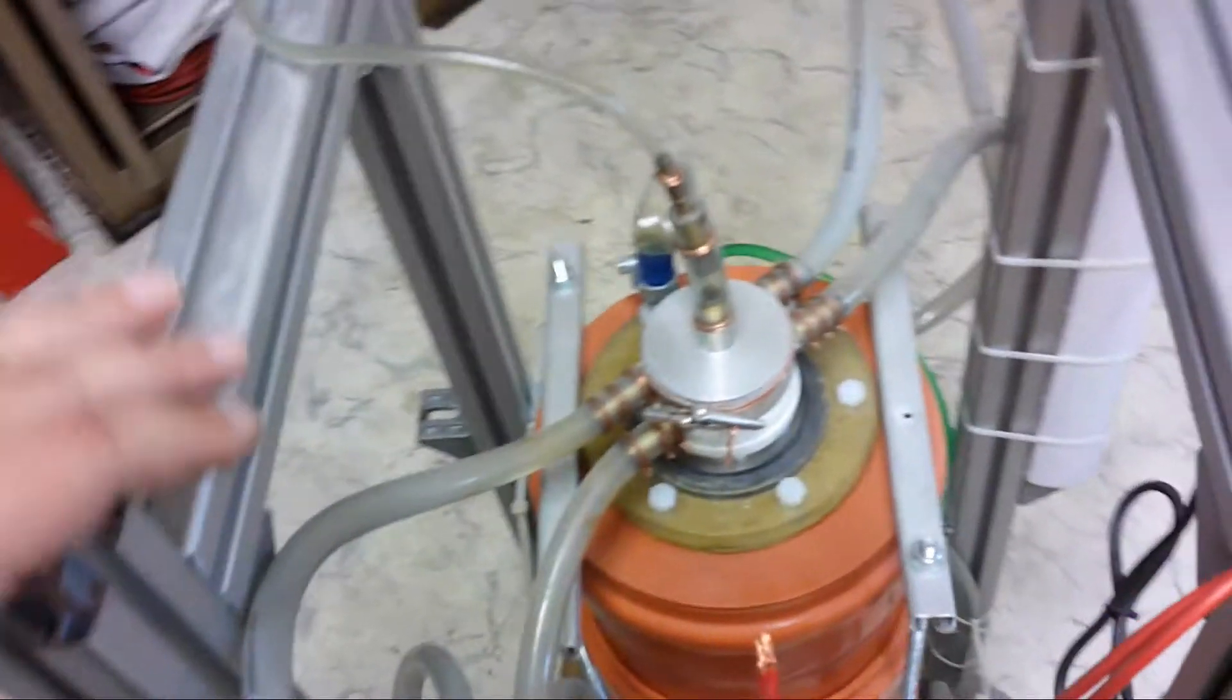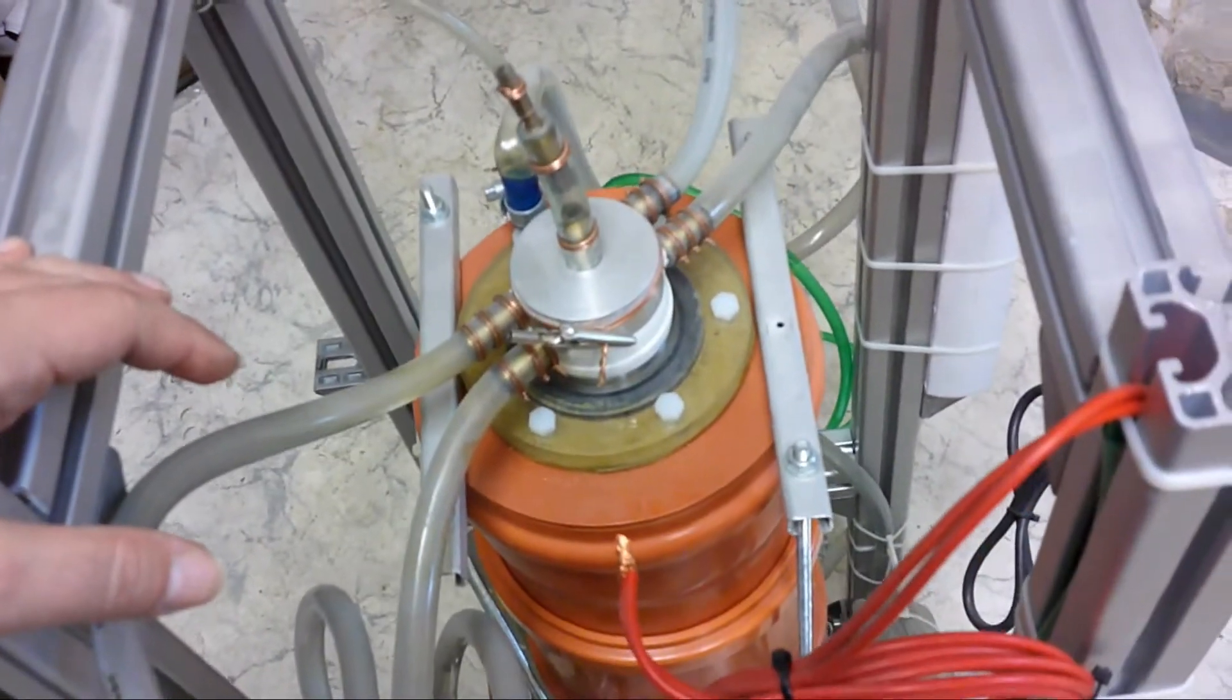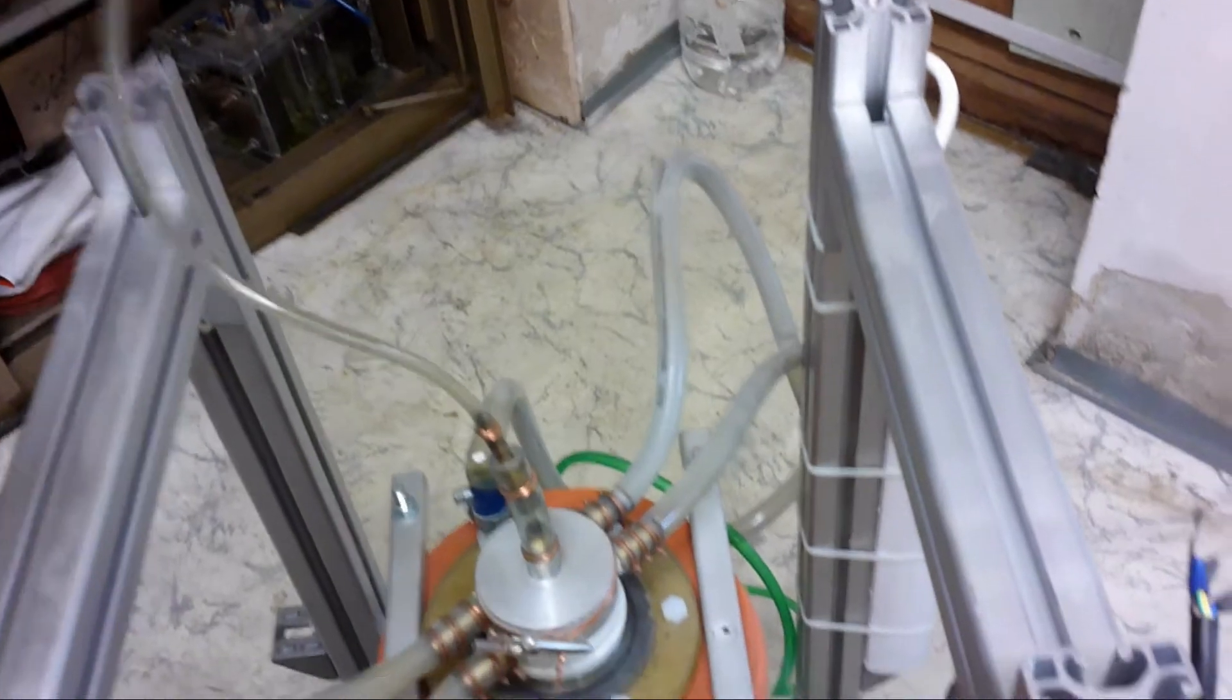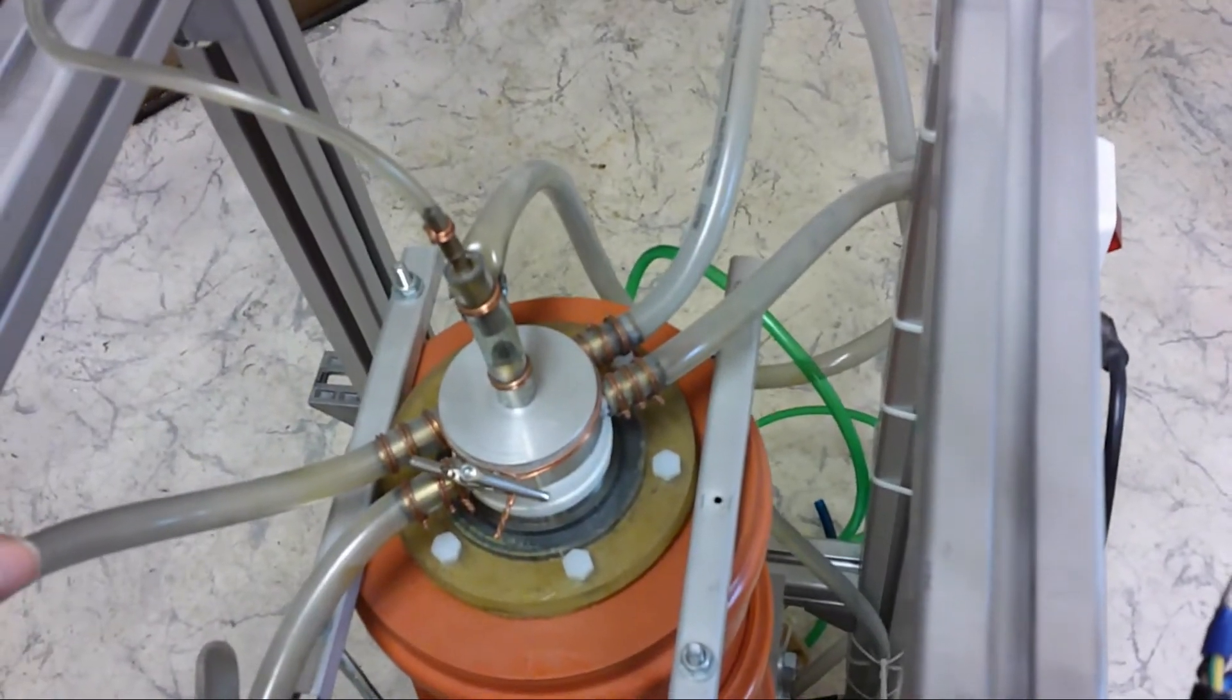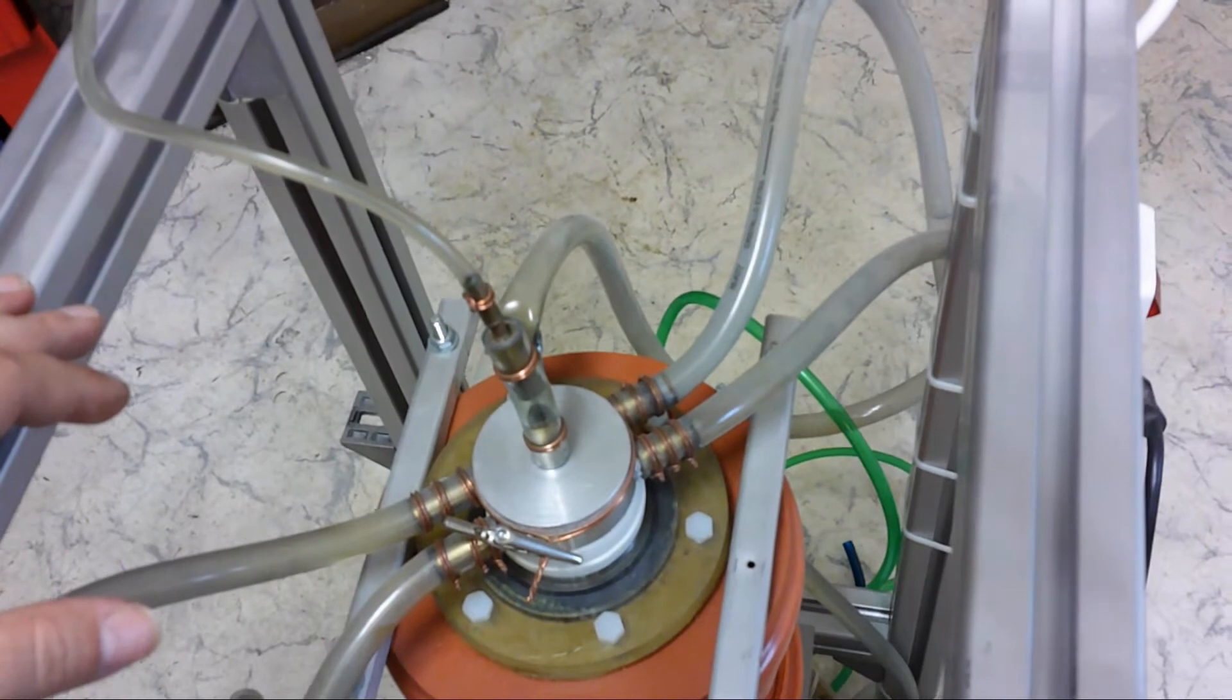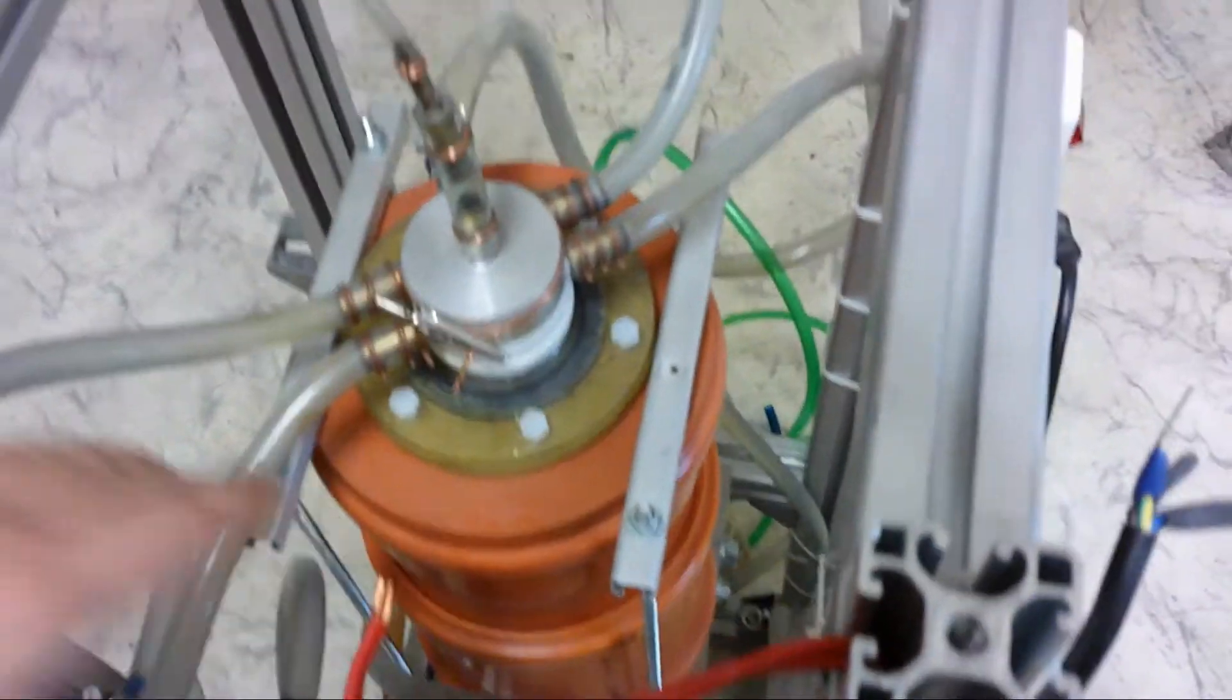And here you can see the actual plasma cell. That was the inlet of the air from the top. The lid of it was water cooled because all the heat of the plasma was going up and heating up the upper part. So this was water cooled as well as the whole thing was water cooled.